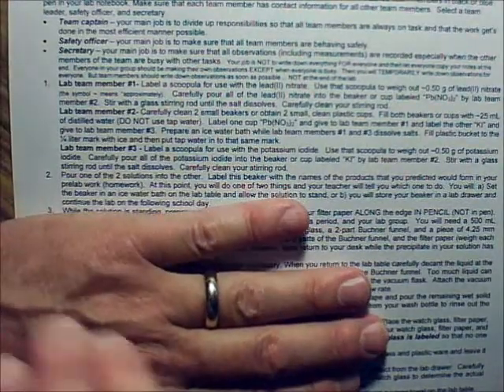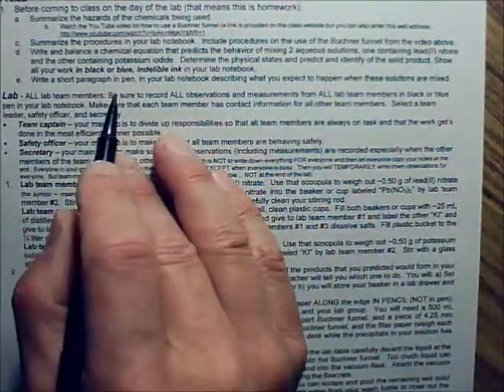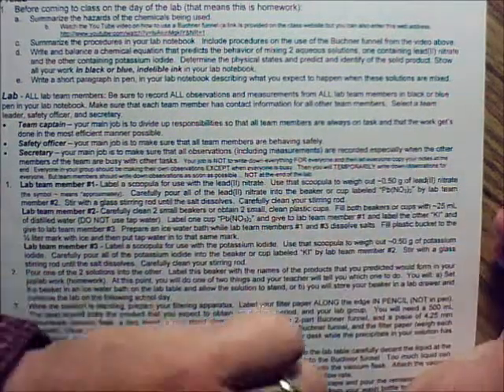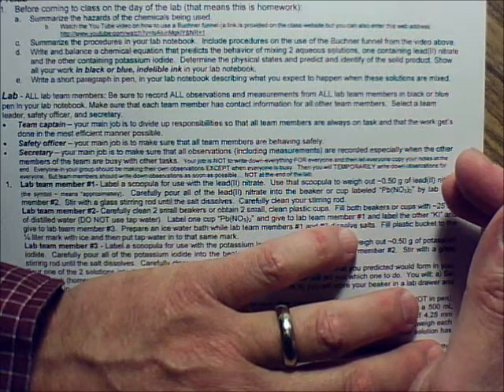What do you think is going to happen when you do this? Right here, it says write a short paragraph in pen in your lab notebook describing what you expect to happen when these solutions are mixed. Well, when you write your balanced equation, you should be able to figure that out. It's not that hard, really.